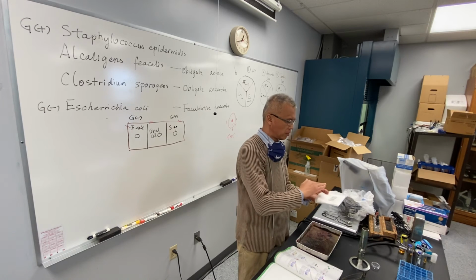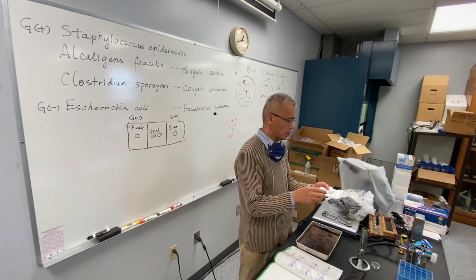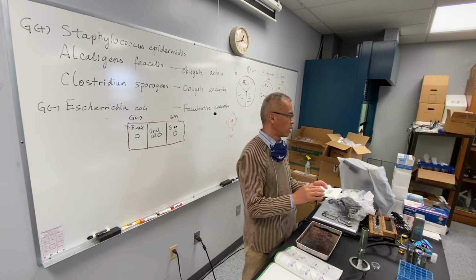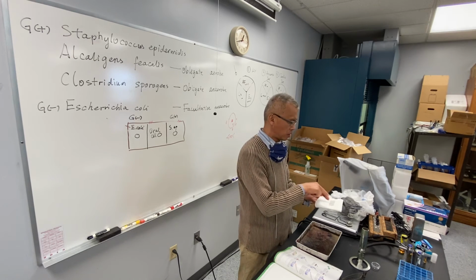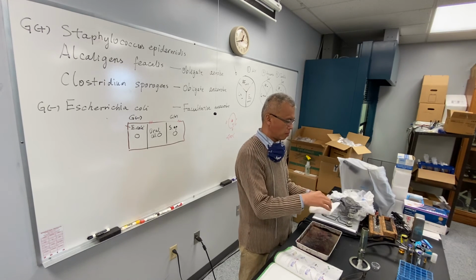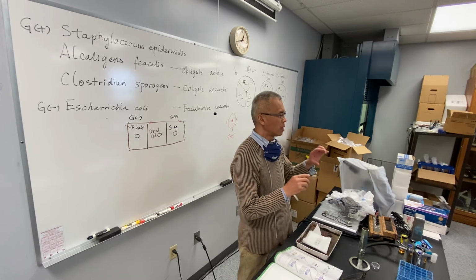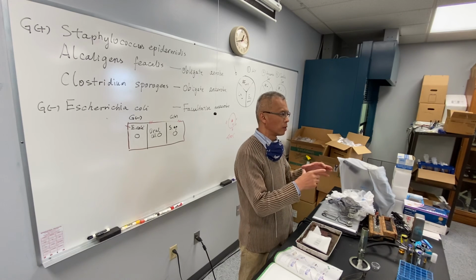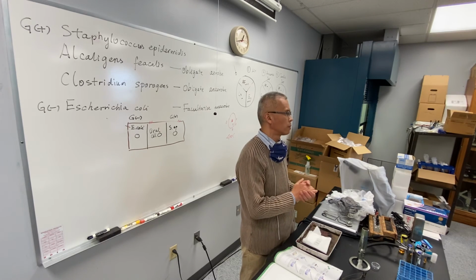So that the bottom part of the slide will dry out, and then let it air dry until you see only a residue of water, meaning probably 50% air dry. And then you put a coverslip on, three here, 1, 2, 3, and look under the microscope. When you start with the scope, start with a low power lens to bring your smear into the field of your vision. And then you can zoom in with high power, and eventually see cells.